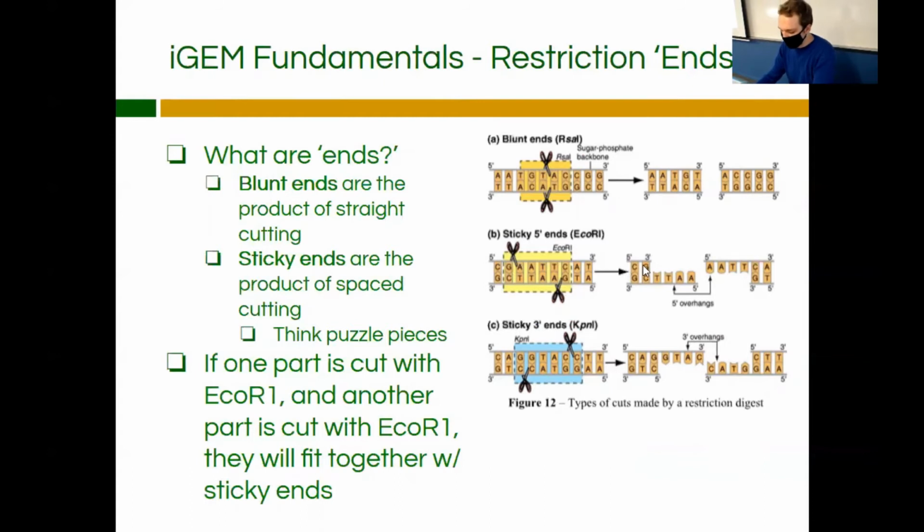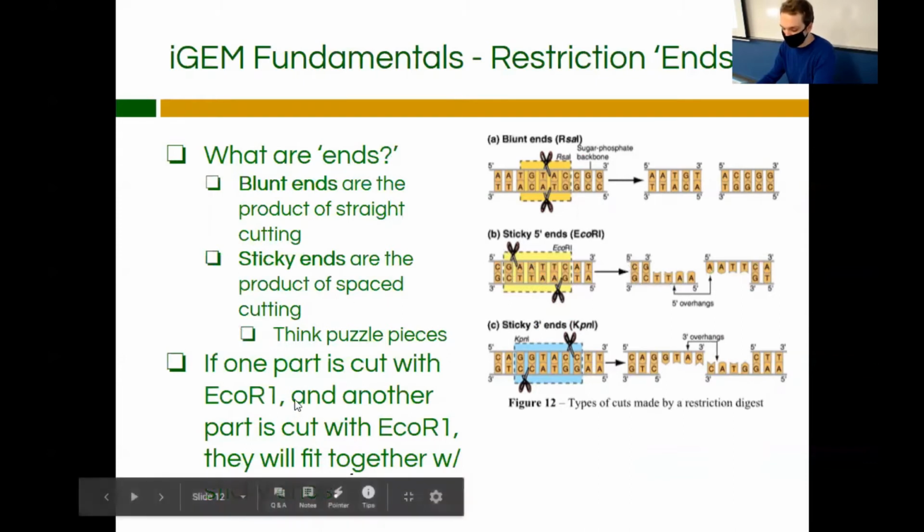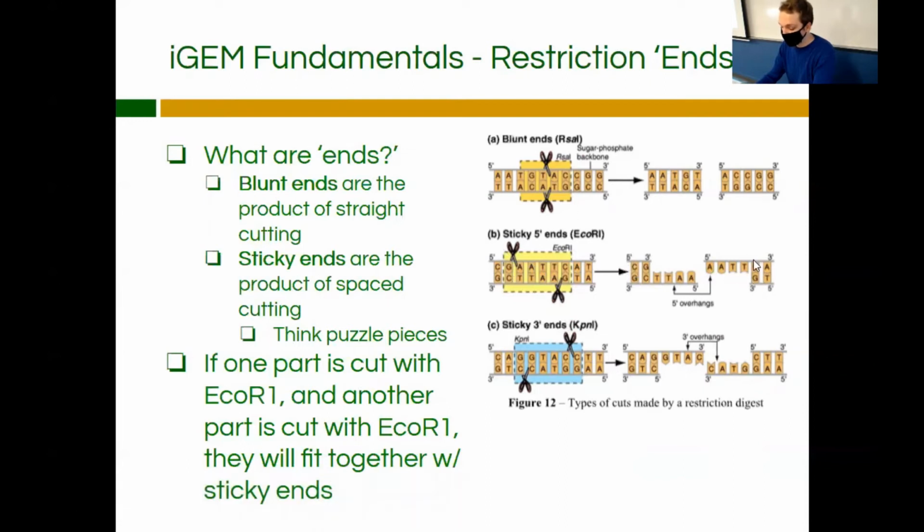When you cut it, you're going to have this overhang right here, and then this overhang on the other side, this part. And you can use these overhangs to match parts up. So if one part is cut with EcoR1 and another part is cut with EcoR1, you can attach them together using ligase, which is an enzyme that catalyzes the bonding of both of those.